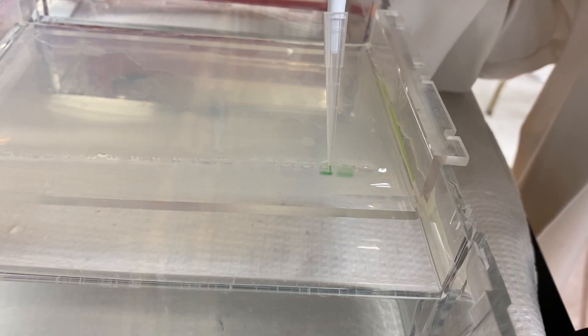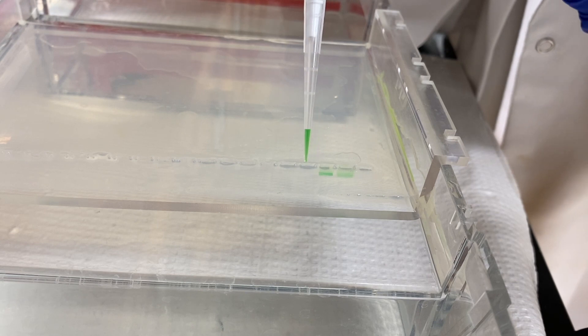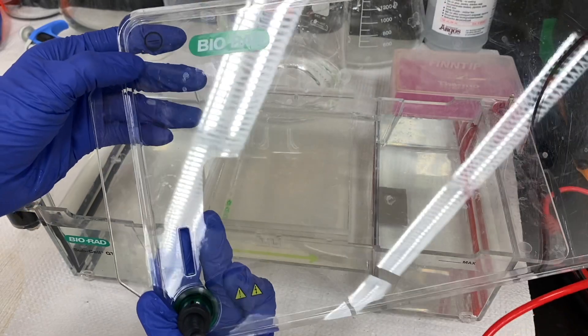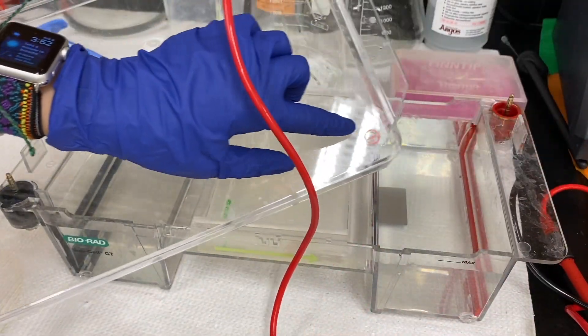I then load about 5 microliters of DNA sample into each of the separate wells, and then I'm ready to start the machine. Putting on the lid, it is important that I orient it with the negative end at the beginning and the positive end at the end.